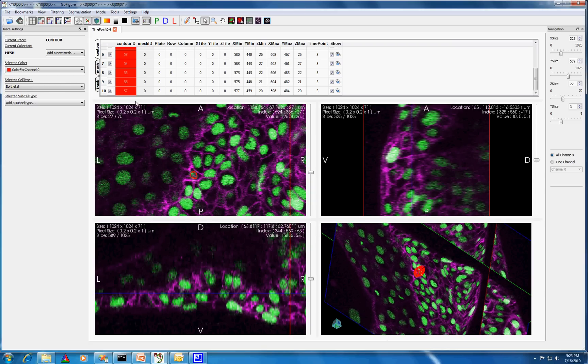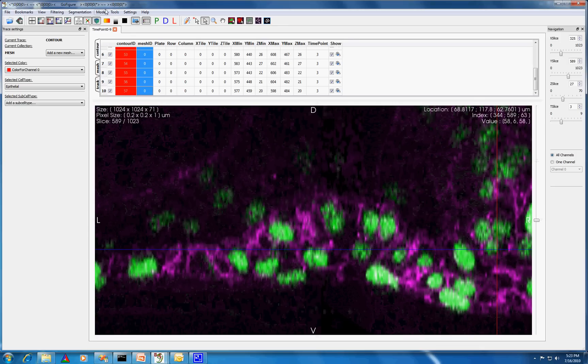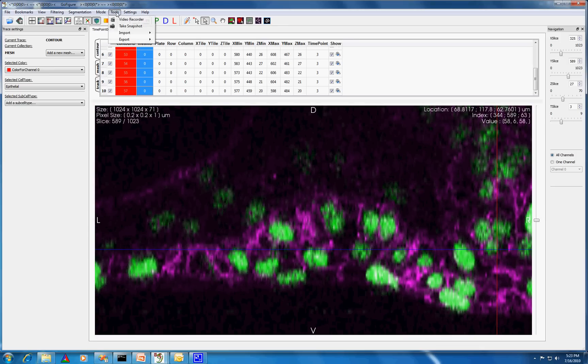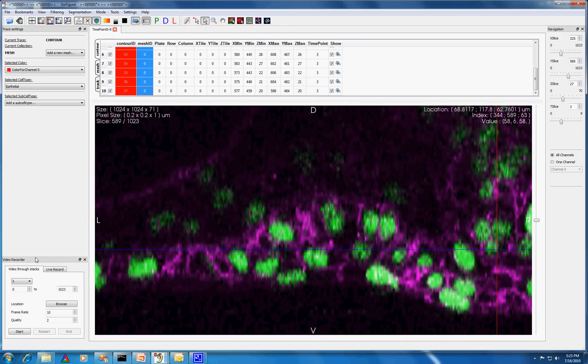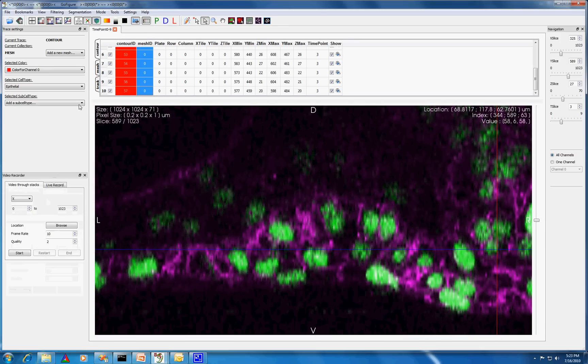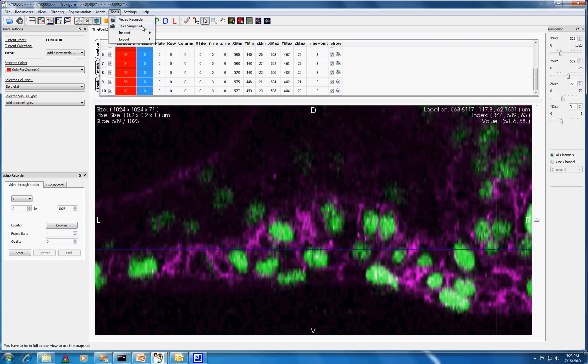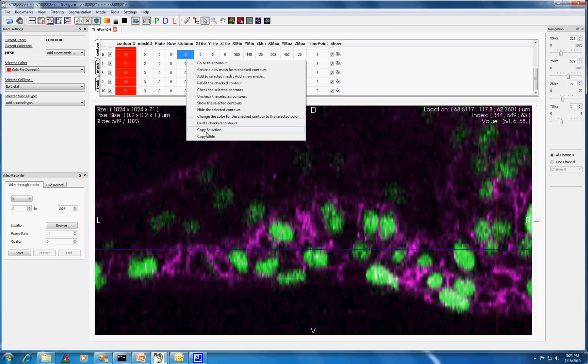There are many other features like making a movie which shows any series of slices sequentially in time, taking a snapshot of the current view, and copying the data from the table widget for analysis outside of GoFigure.